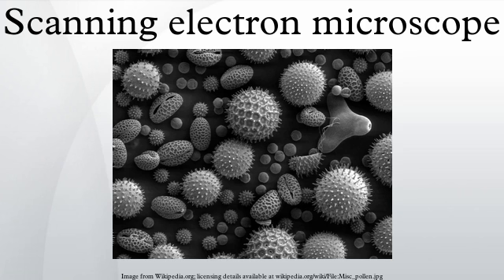The fractured surface is cut to a suitable size, cleaned of any organic residues, and mounted on a specimen holder for viewing in the SEM. Integrated circuits may be cut with a focused ion beam or other ion beam milling instrument for viewing in the SEM. The SEM in the first case may be incorporated into the FIB. Metals, geological specimens, and integrated circuits all may also be chemically polished for viewing in the SEM. Special high-resolution coating techniques are required for high magnification imaging of inorganic thin films.